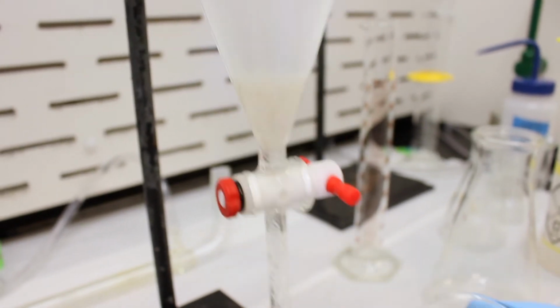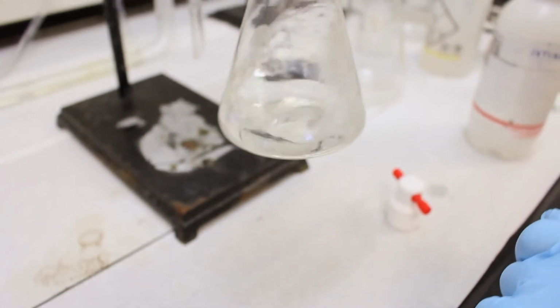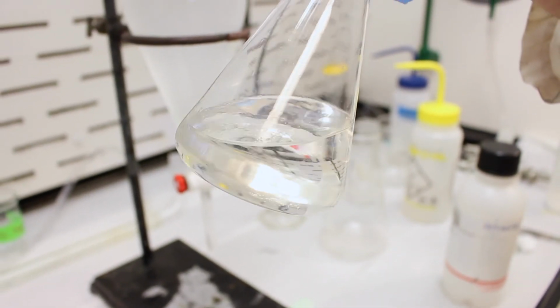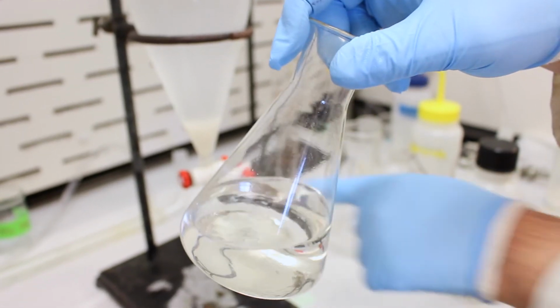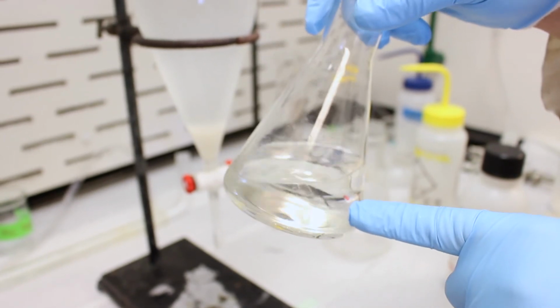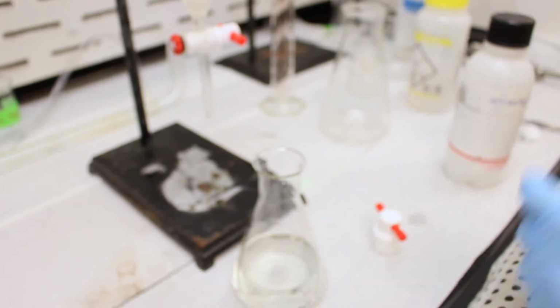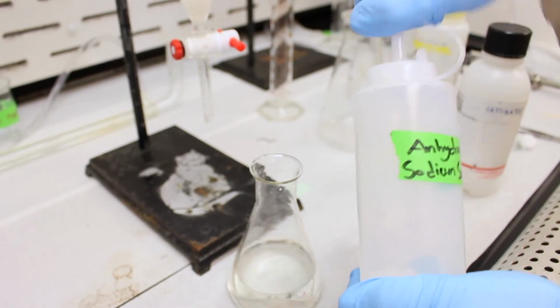So we've got our 3 DCM extracts combined in this flask, and as you can see, maybe you can see or maybe not, there are a few bubbles of water floating in there, and they're visible because of our emulsion problem here. We didn't perfectly separate the layers, and inevitably there's always going to be a little bit of water in the dichloromethane. So to resolve that, we have our anhydrous sodium sulfate, and we're going to add some here.